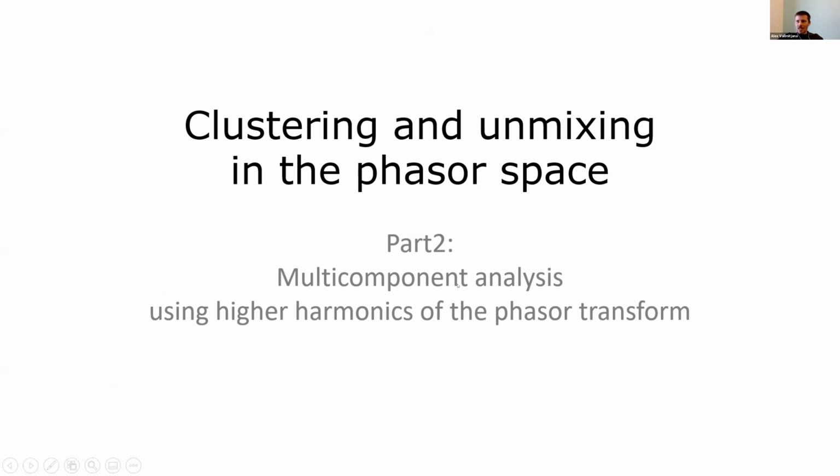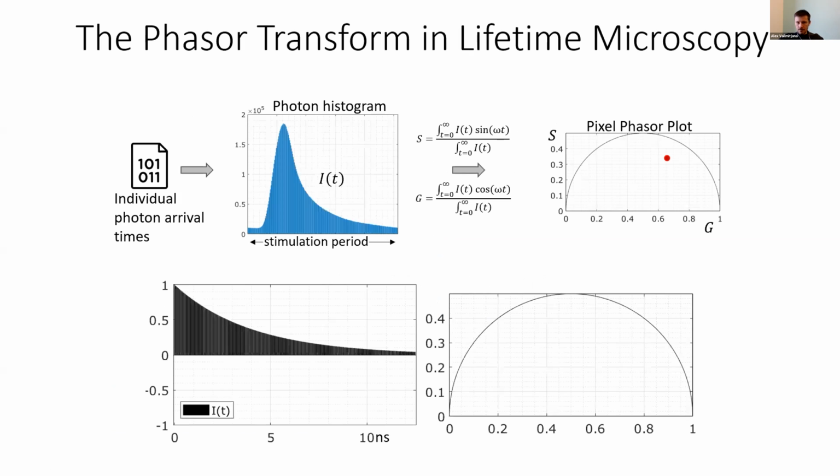Okay, well, moving on to the second part. Multi-component analysis using high harmonics on the Phasor transform. You have learned this morning about the Phasor transform. I'm going to do a quick recap.